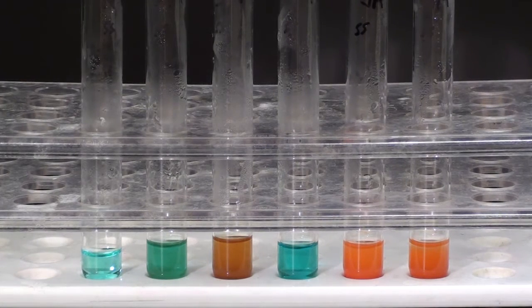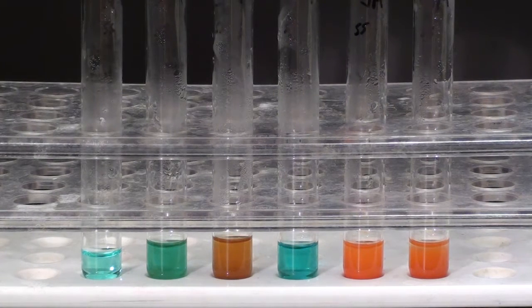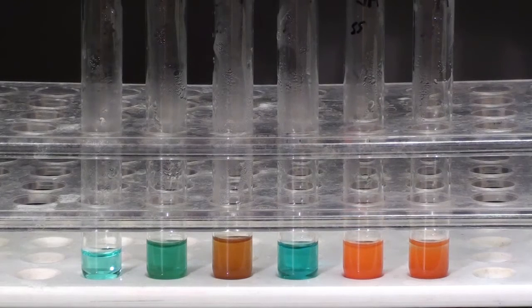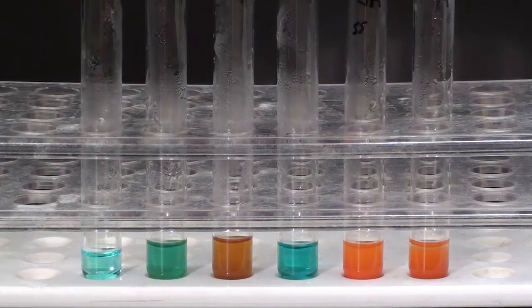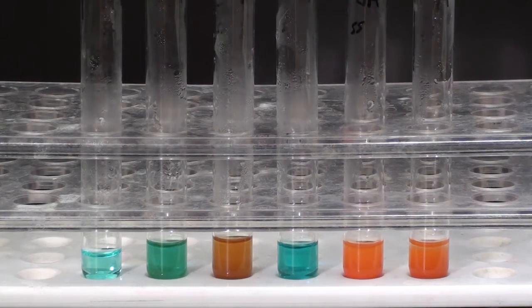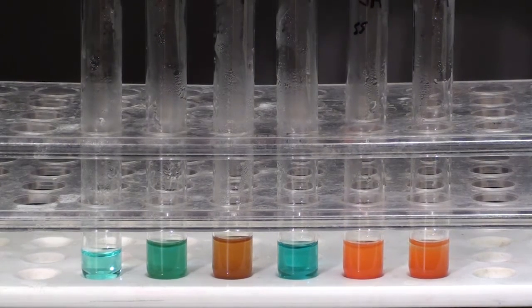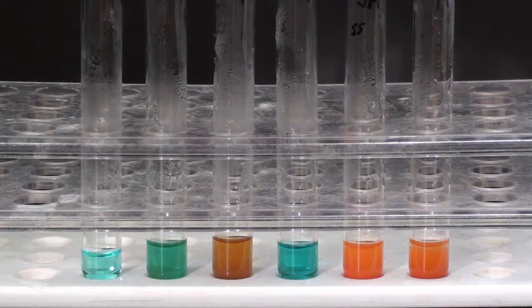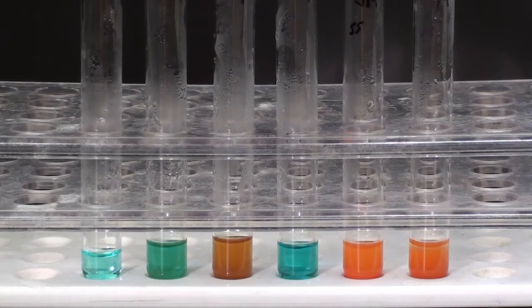Test tube five was amylase and starch. After a half an hour body temperature, lots of sugar was produced. We can see that because the Benedict's reacted with the sugar and produced this orange brick color.